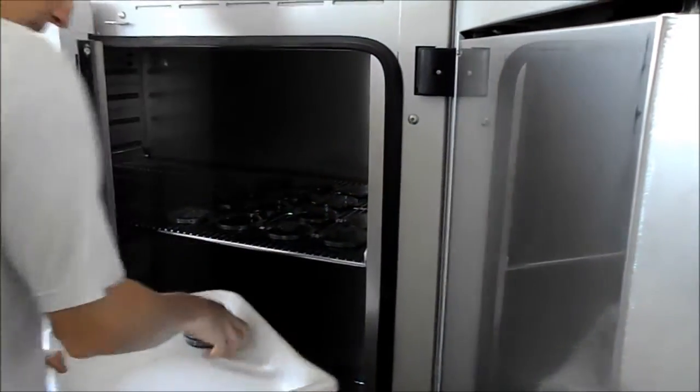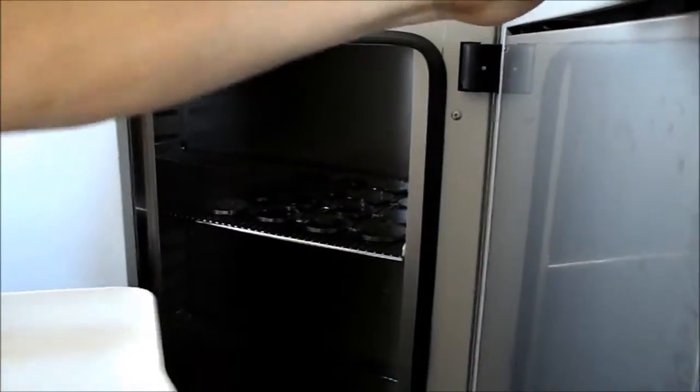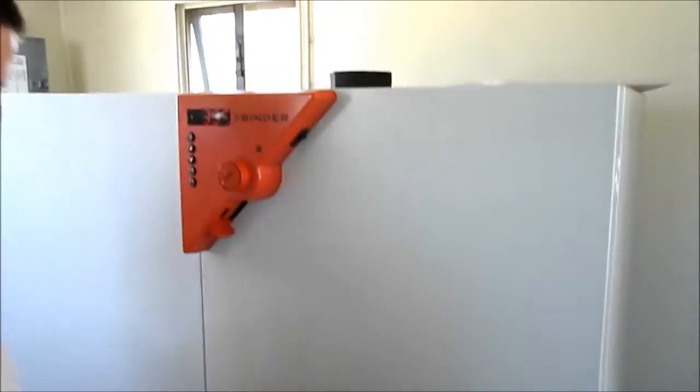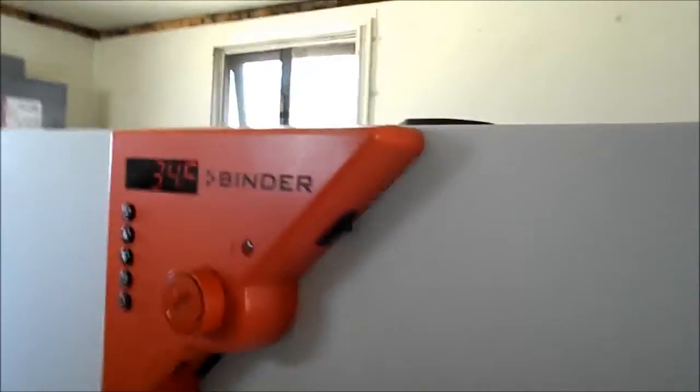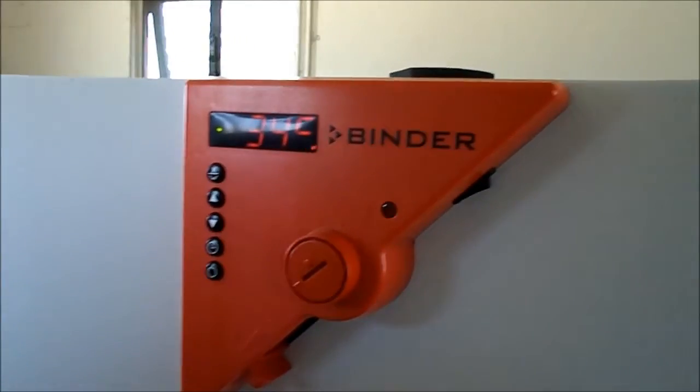And you keep it for 18 hours? 18 to 24. Very good. And you set it already to 35? Yeah, I'll check that again. Okay. Very good. Yeah, it dropped a little bit because you opened the door. But turn it up slightly. Okay.